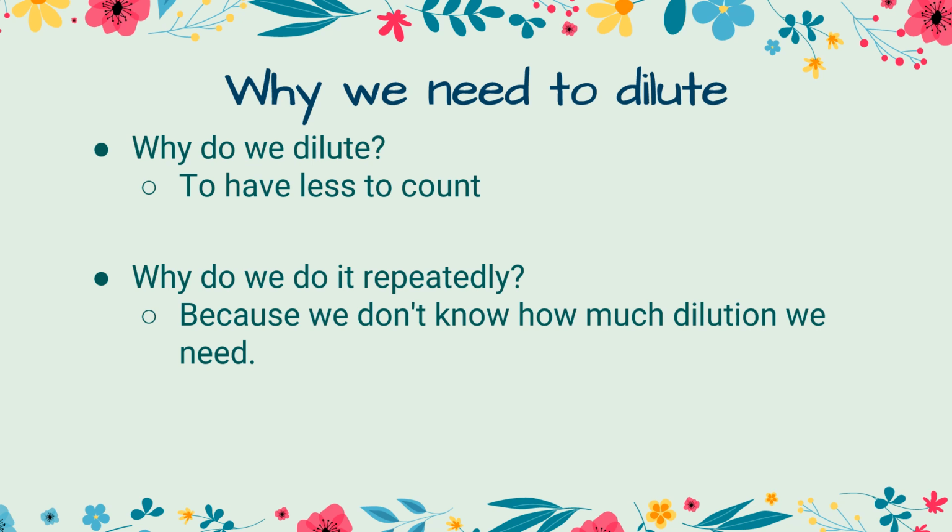So we might do 5 dilutions and grow 5 plates, and then we end up throwing away 4 of them. It sounds wasteful, but it is much quicker than doing a dilution, plating it, and then finding out that that dilution was not low enough and having to start all over again the next day. You've now wasted a day instead of doing it all in one day.